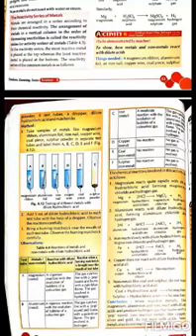And the gas catches fire with a pop sound and burns with a pale blue flame. The gas evolved is hydrogen.